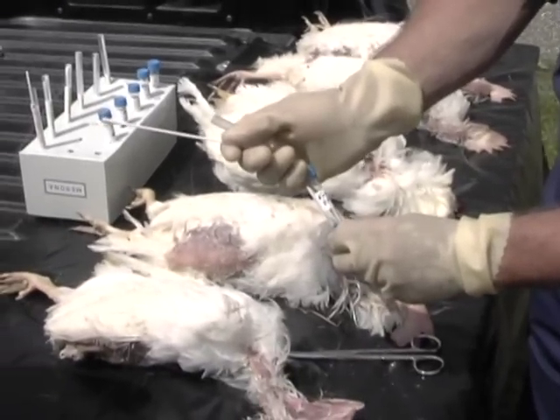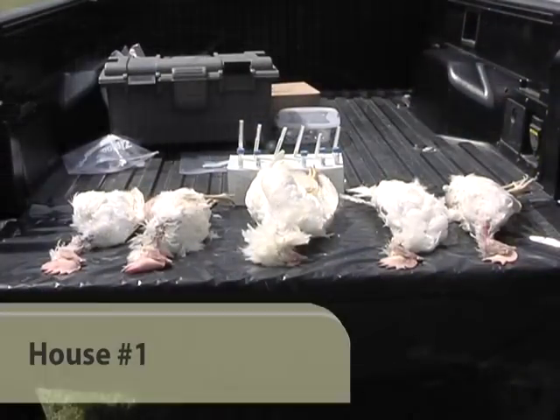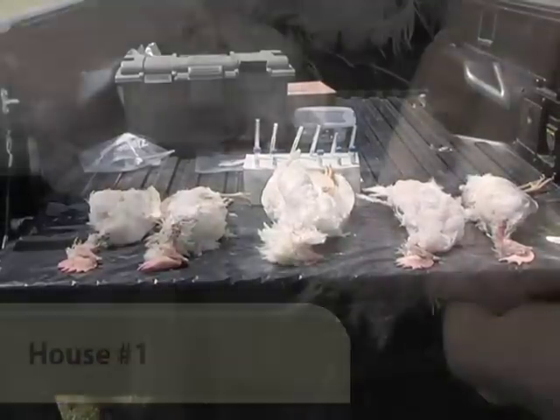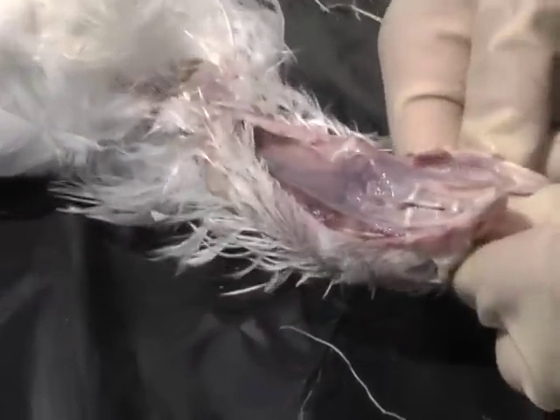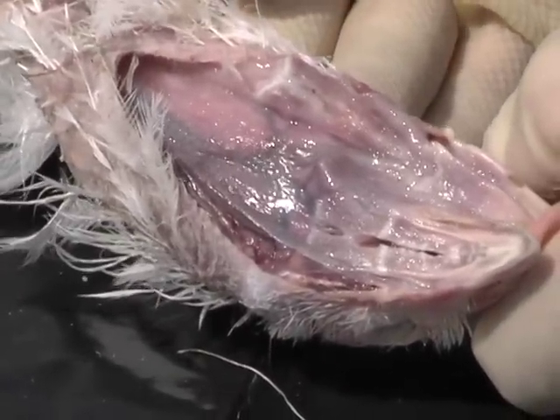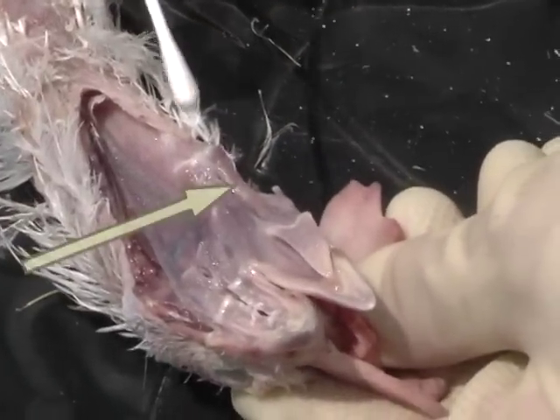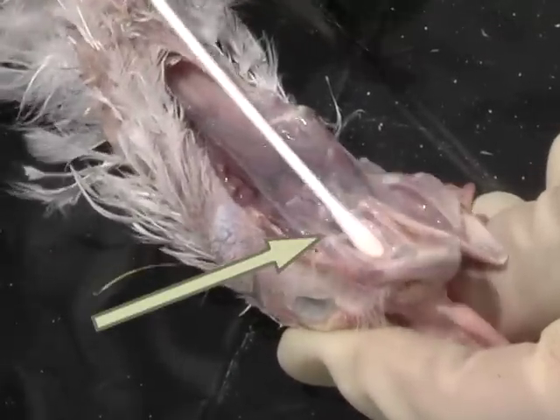Loosen the cap on the BHI tube for the house you are collecting samples from — here, we are sampling house number one. With your left hand, grasp the comb and the wattles and pull them together behind the head, so that the glottis and palatine cleft can be easily observed. Swab both the glottis and palatine cleft, picking up as much mucus as possible.